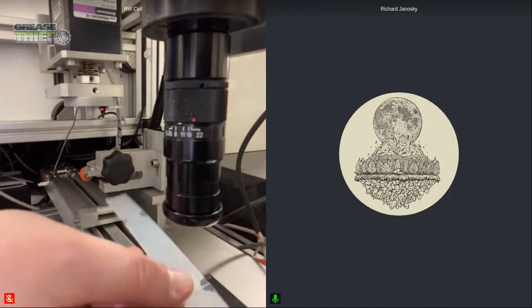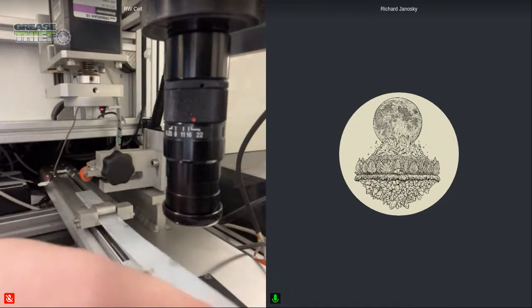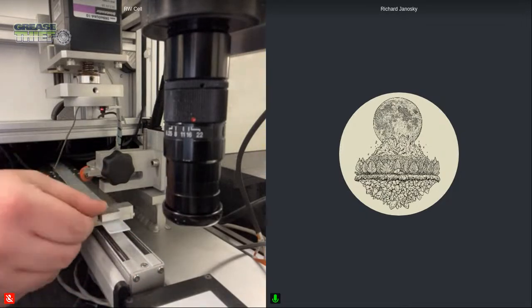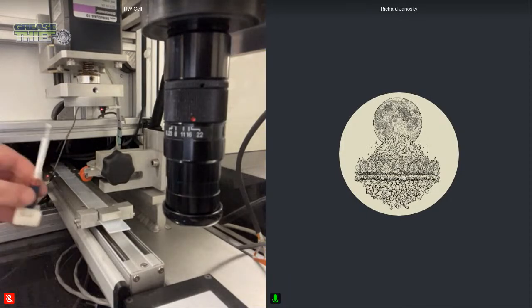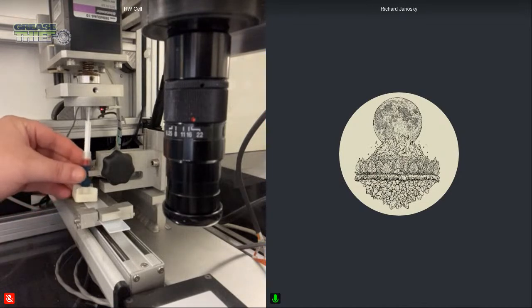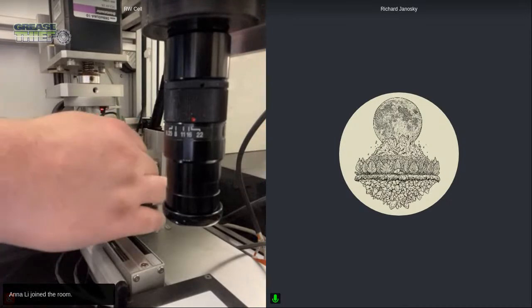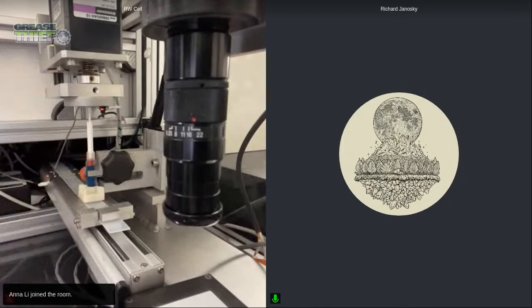So simply just taking the substrate, it's going to slide right in that spot in the table it's made for, and then I'm going to lock it in place. And then from the heating rack, I'm going to grab my next sample, and then I will bring that down, and I'm simply just going to use my one hand, push it back against it so it's flat, and then I'll turn my knob to lock it in place.